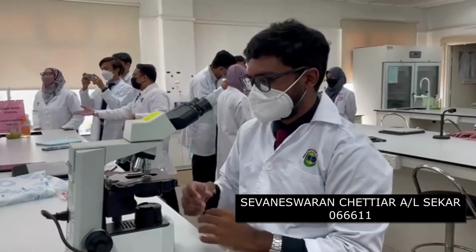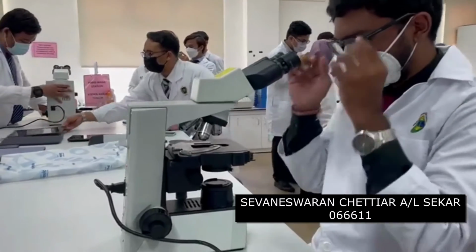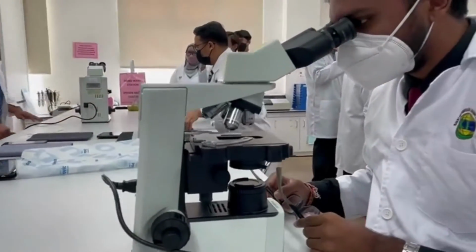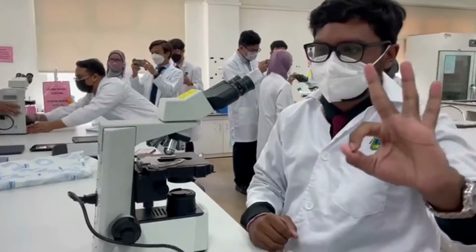Rotate to the lowest power objective lens. You want to make sure that you can look through the lens without being too concentrated on one area. If it's too powered, you won't be able to make out anything through the lens.